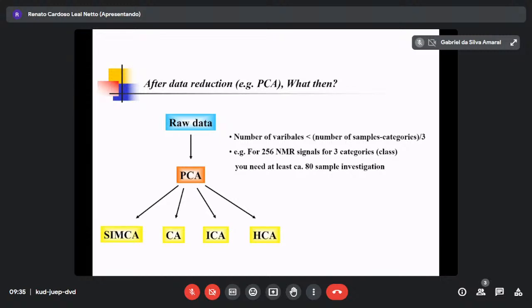But then the question is, what is the easiest way? You have to reduce variables. Reduce variables means with LCMS, I will do targeted analysis, where I only detect one compound or two compounds. It's a big deal. Yeah?